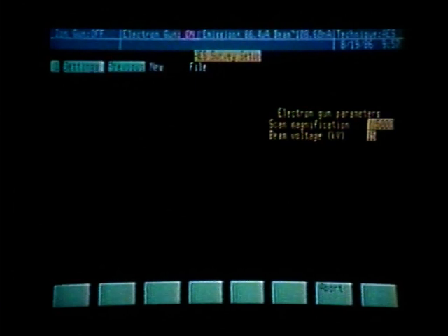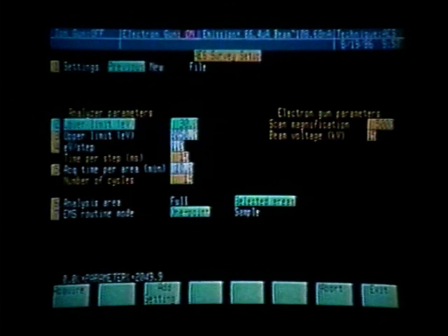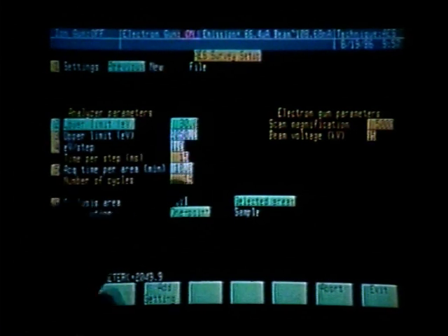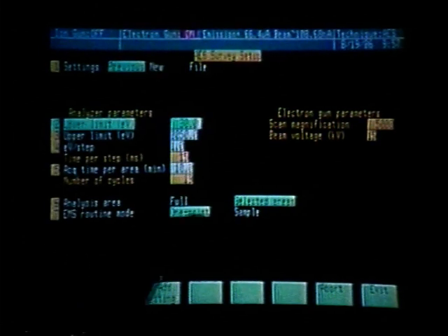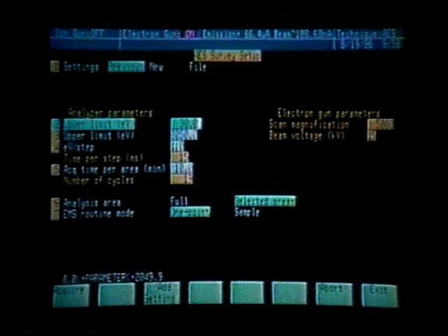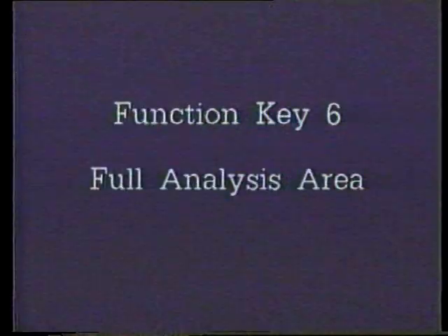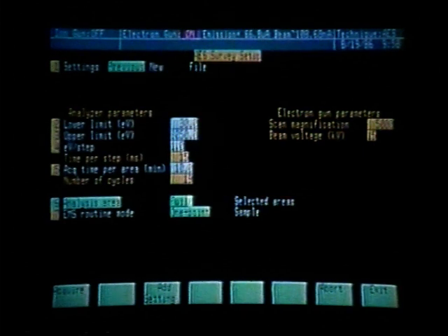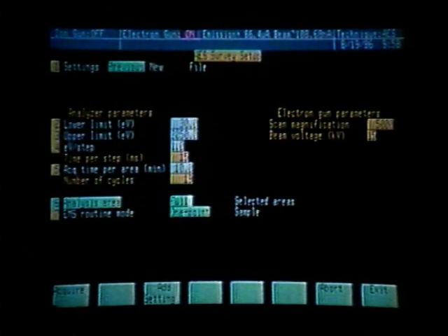We now see all of our previous parameters: lower limit of 30, upper limit of 2,050, 1 volt per step, 10 minutes per area. What I would like to demonstrate is the analysis area. We used selected areas looking at areas 1, 2, and 3. If we wanted a survey scan representing an average of the area scanned on the TV, we would ask for analysis area full. We press function key 6 and toggle it to full. Once full area is selected, we could go directly to acquire by pressing soft key number 1.